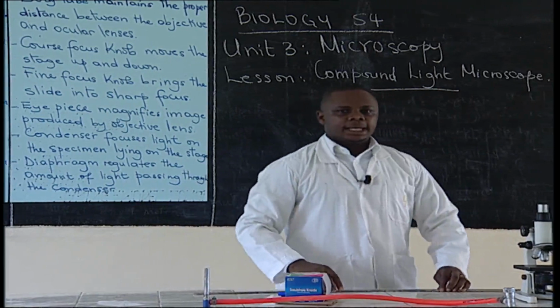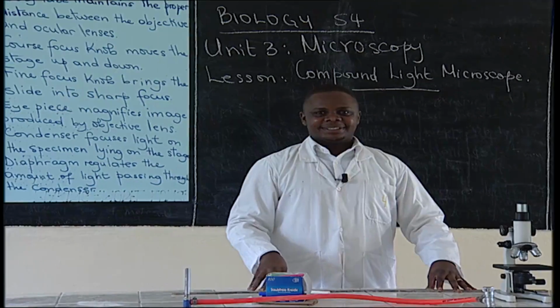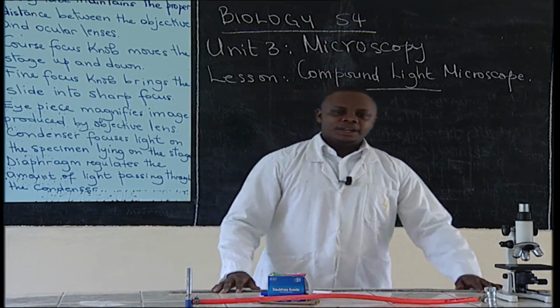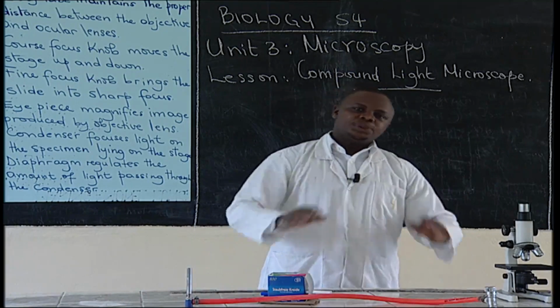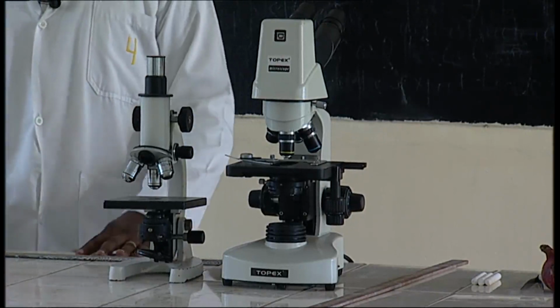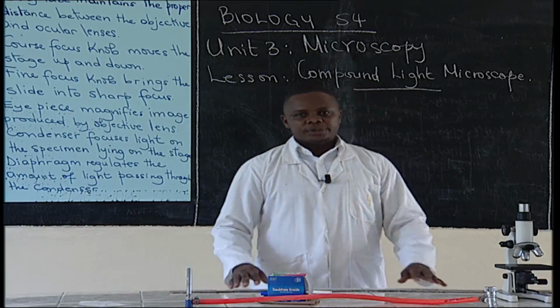Students, have you ever used a microscope? Well and good if you have ever used one. And if you have never used one, our today's lesson will let you understand different parts of a microscope and their functions. You will also know how you can use the microscope.